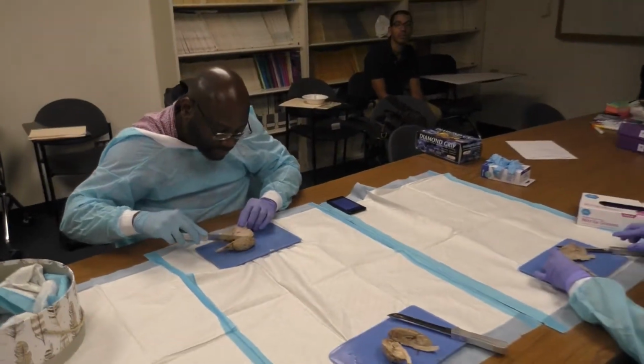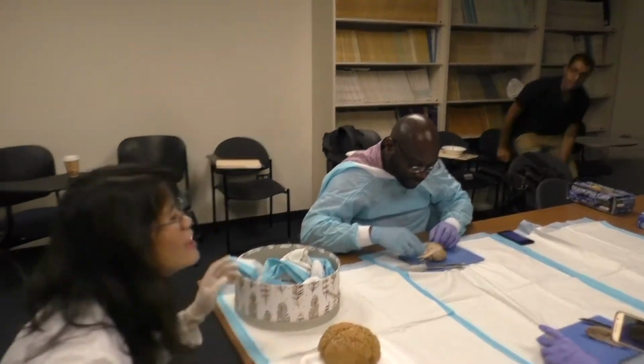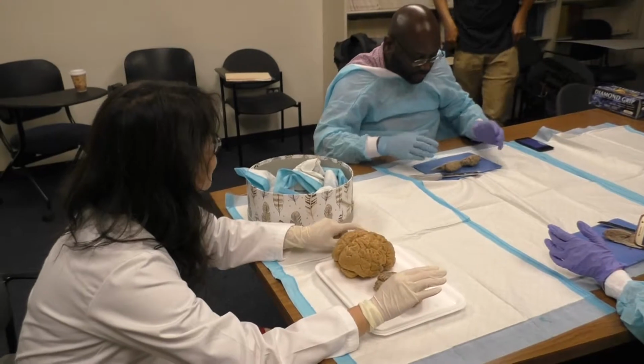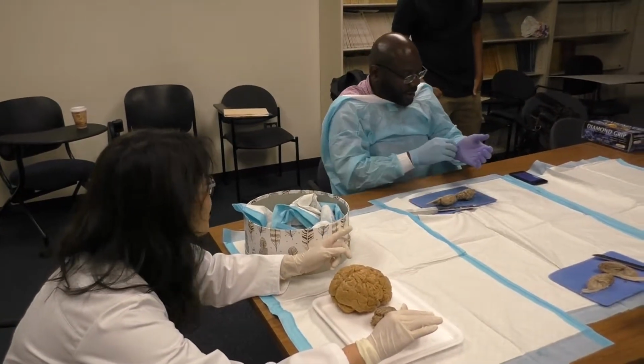Perfect. Go ahead and take some pictures of that first cut, and then we'll go through some of the major structures that you can see in the middle of the brain. You can take your gloves off and get new ones.